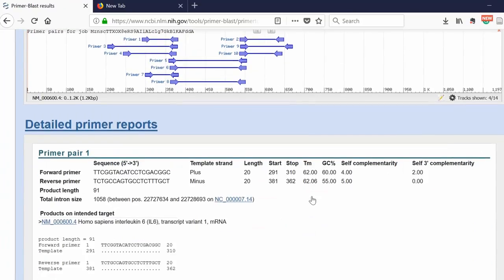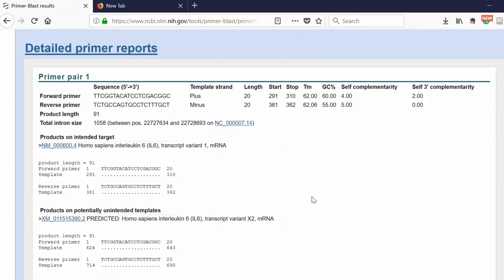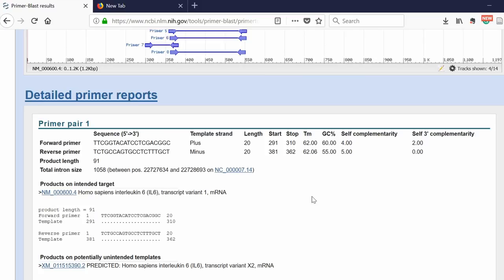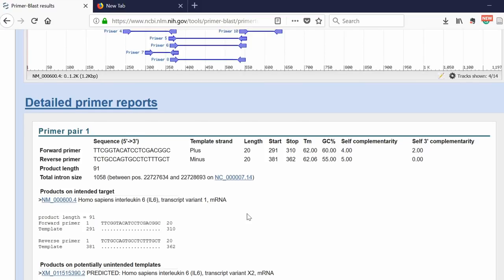If you scroll down, you'll get a detailed report for each primer set. Let's look at Primer Pair 1, for example. The Primer Blast software is giving you the sequence for each forward and reverse primer. Also, the product length - if you did a PCR, this would be the product size in base pairs. The intron size - this is the good thing about using Primer Blast.